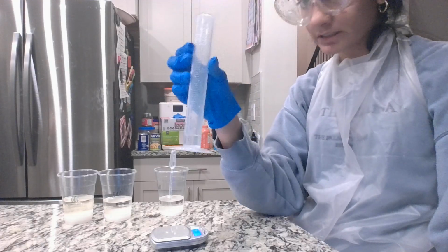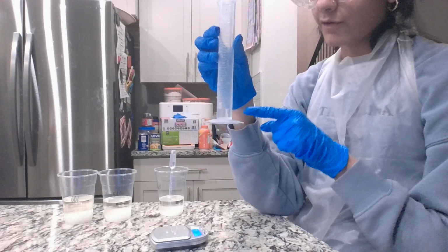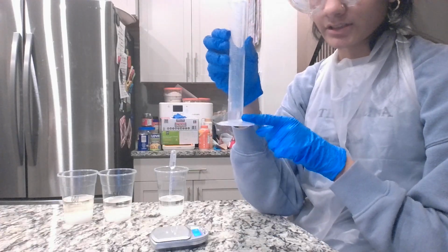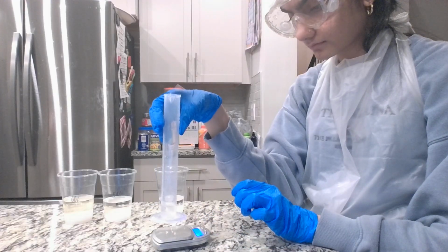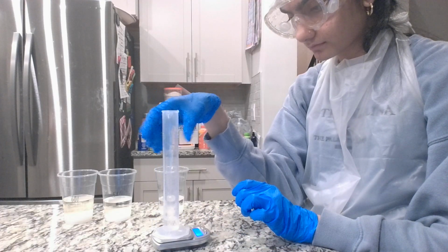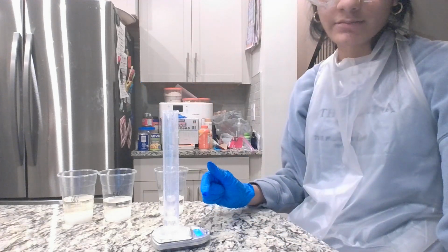This is 5 milliliters of solution, and now this is 40% of sucrose in solution, and it weighs about 36.24 grams.